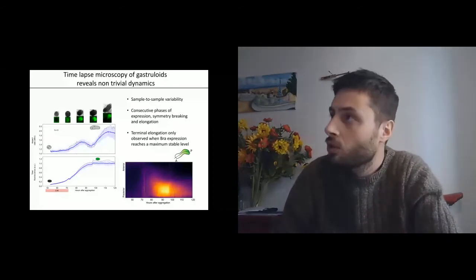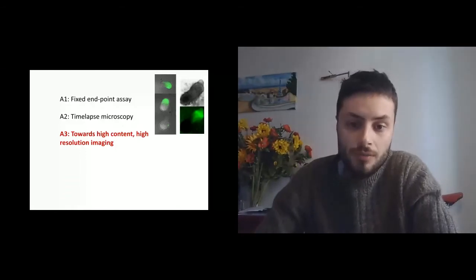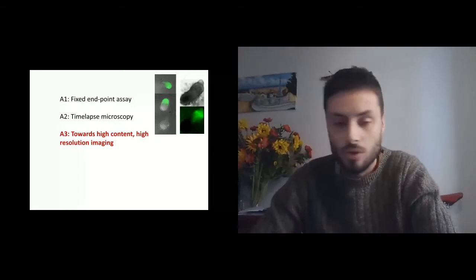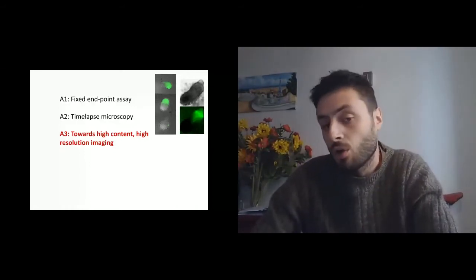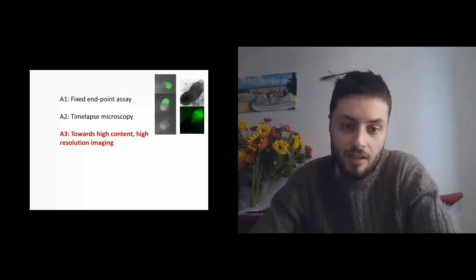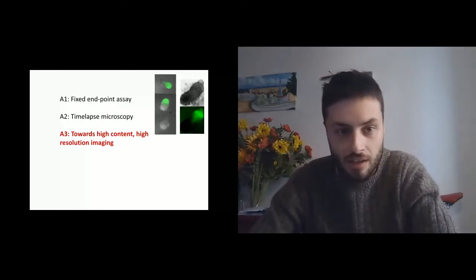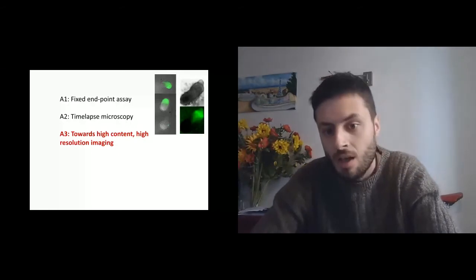So as you might have noticed in the images that I've shown you so far, those were all 2D images. It is possible, of course, with HCS to also perform 3D images. And we now know that it's essential to perform 3D images to understand the dynamics and really explore all the phenotypic variability that is present, in our case, in the patterning of these gastruloids.